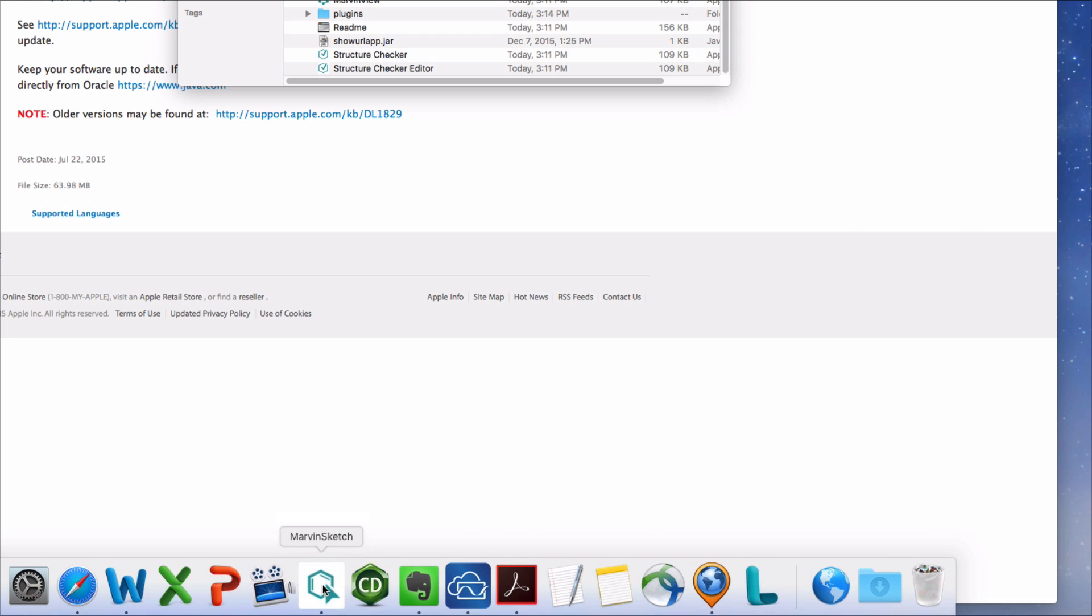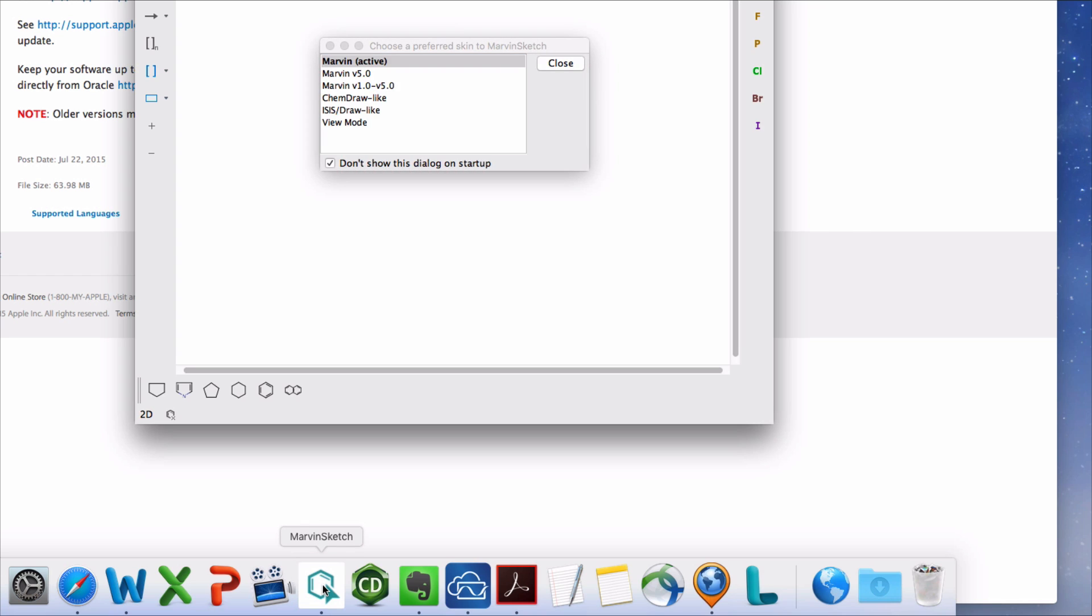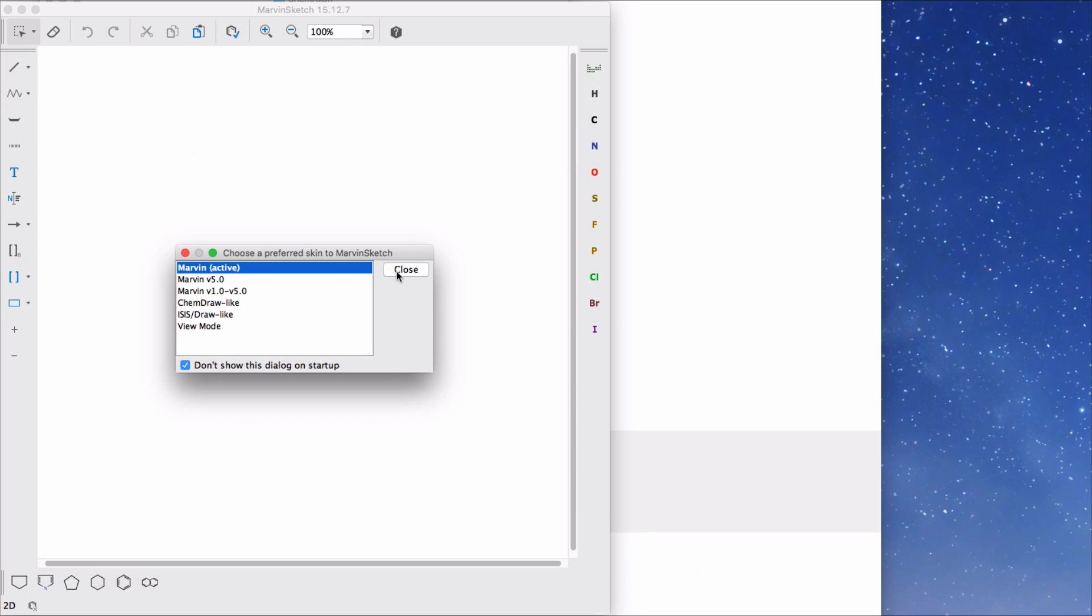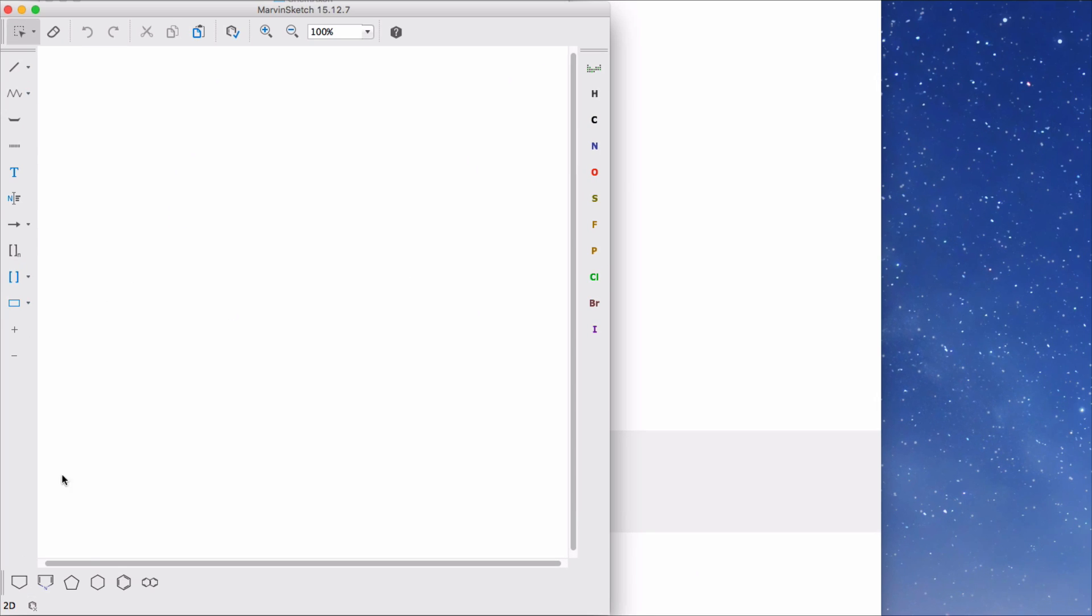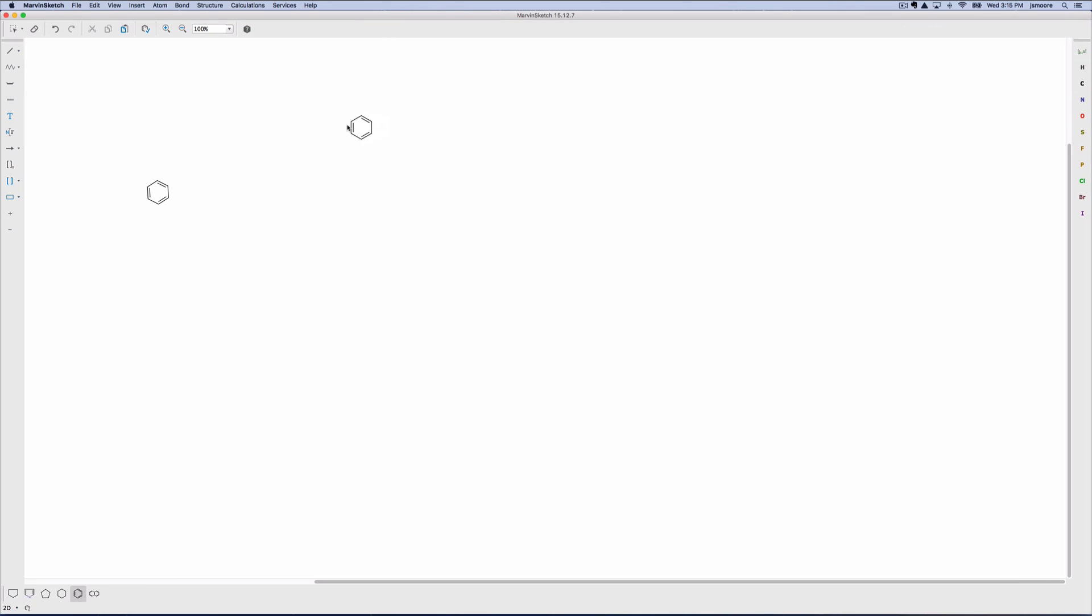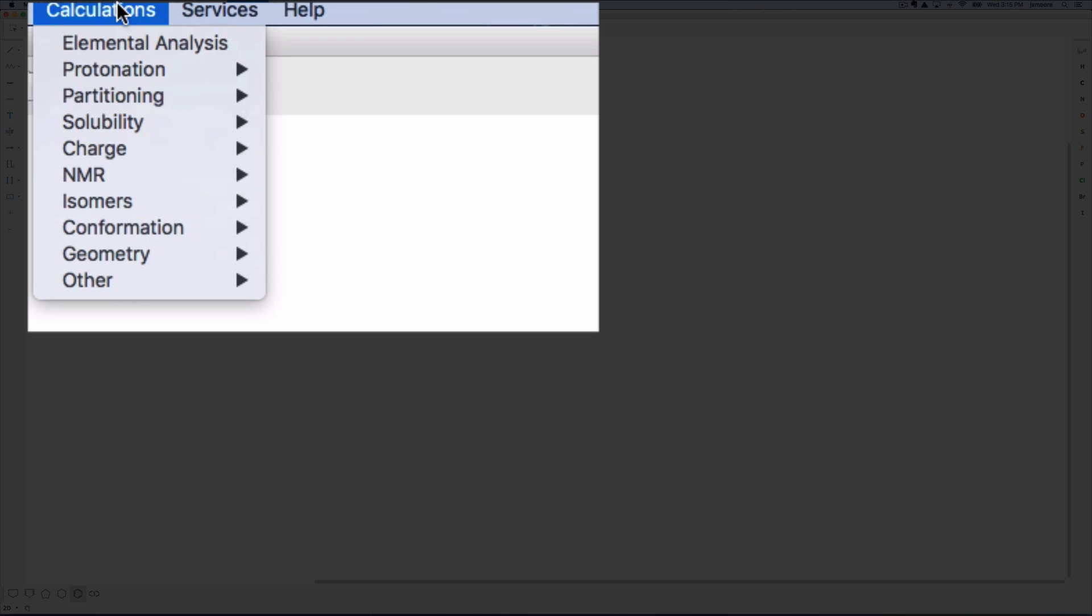Now launch the Marvin Sketch application. Accept the default skin and we're ready to begin. I'll show you why you'll want a license for the calculator plugin package. Add any molecule to the drawing canvas.